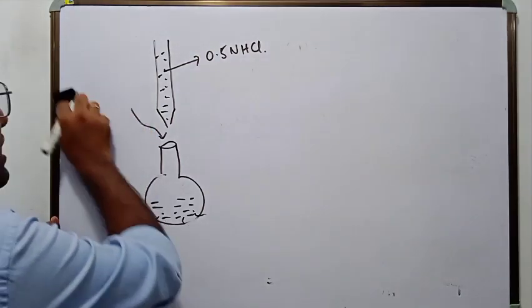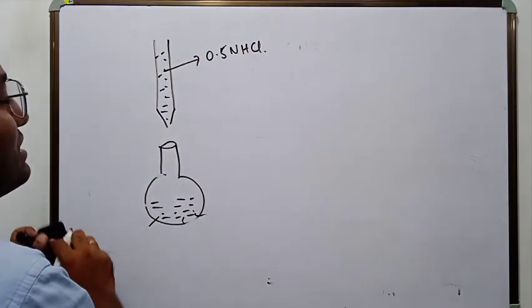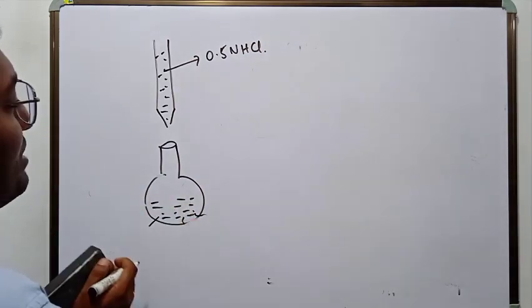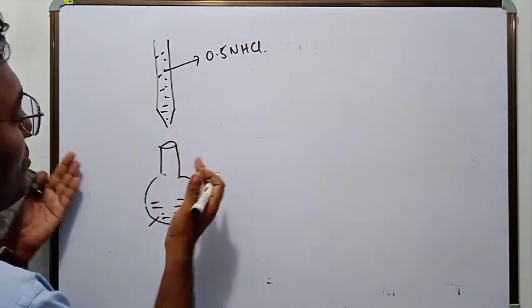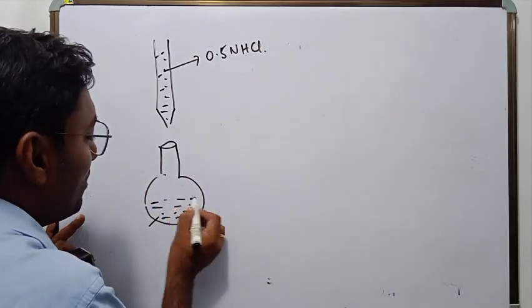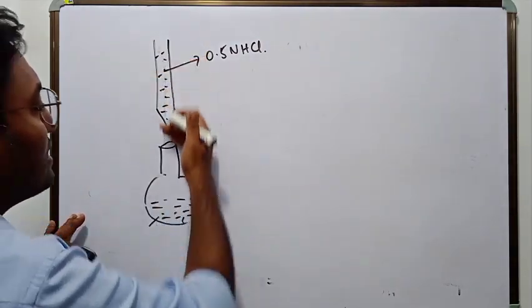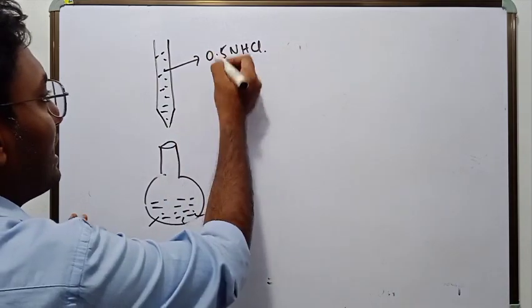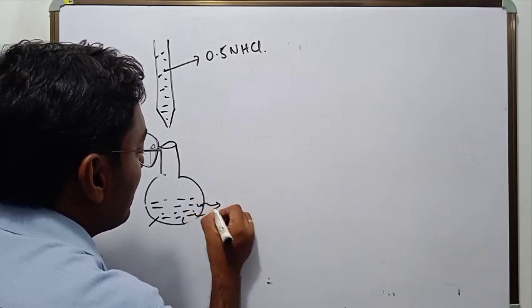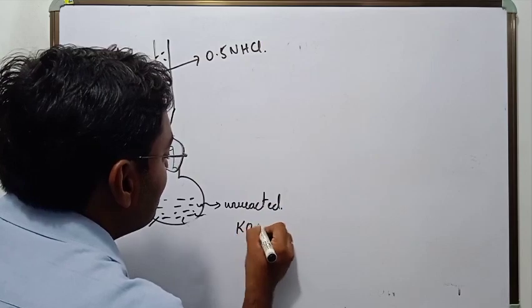So after you add phenolphthalein, immediately a pink color will come because the solution inside is alkaline, and phenolphthalein would exist in ionic form in alkaline medium, and that ionized form is pink in color, and therefore the solution becomes pale pink. Now you conduct the titration. You are actually titrating the excessive, unreacted amount of KOH against HCl.